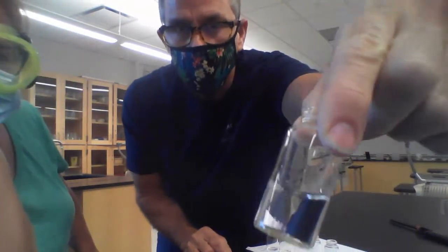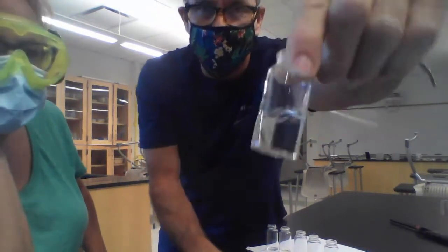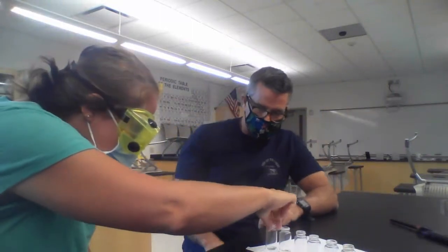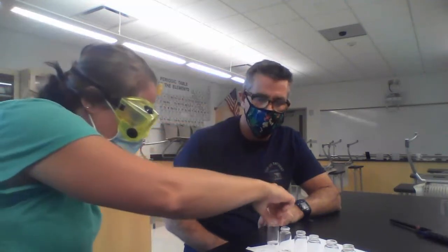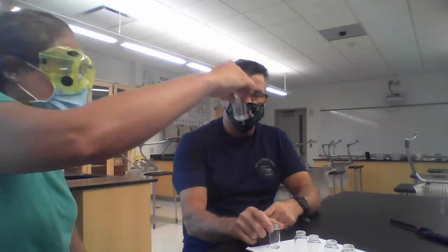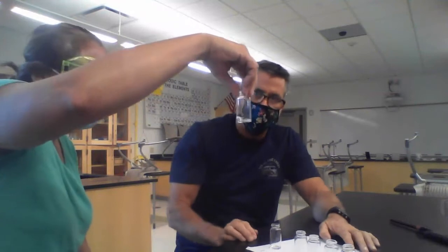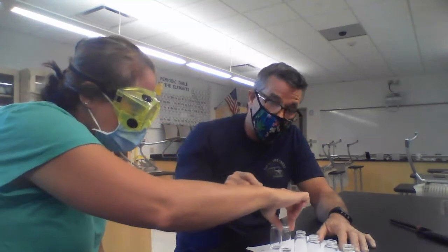So, at an original glance, what I notice about number 6 is it tends to have like a different tint to the rest. Yeah, I want to tell you guys that's a slight artifact. That happened to do with the bottle being not 100% clean. So let's assume they're all clear and colorless. I agree, it does look slightly yellow. So this one seems pretty thin. Number 1 seems thin is the word she's using. This one, as I swirl it, tends to like stick to the edges more. We could call that greasy.